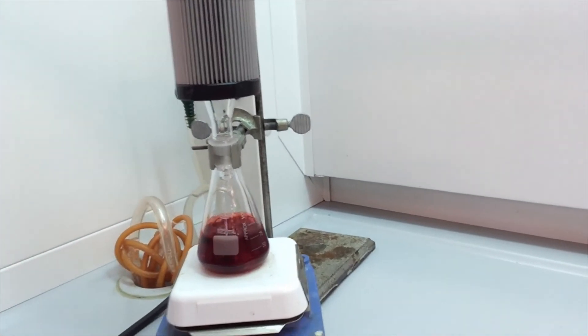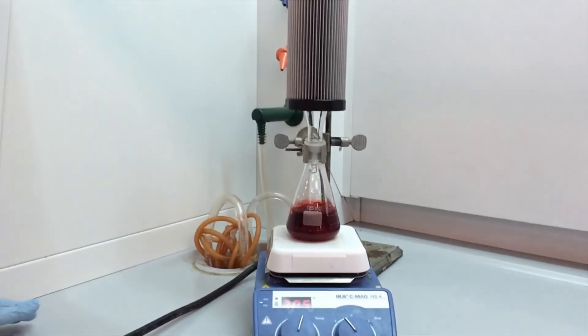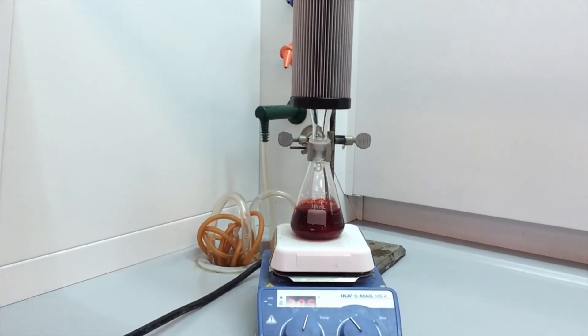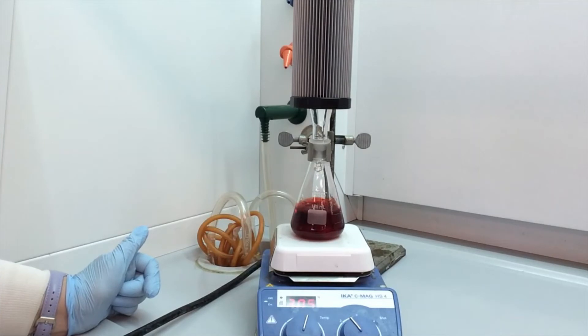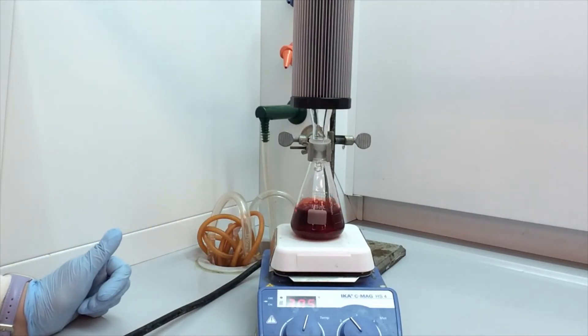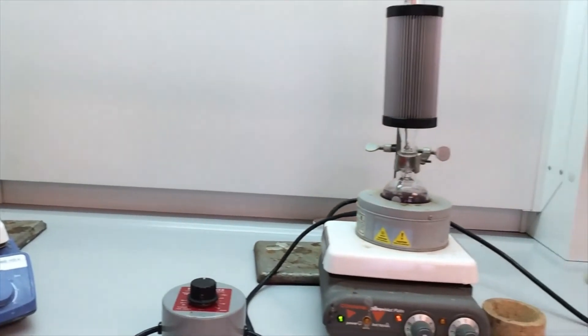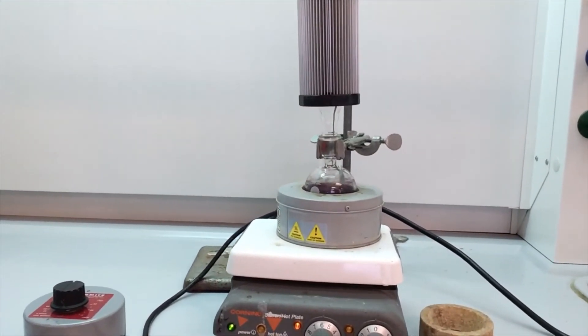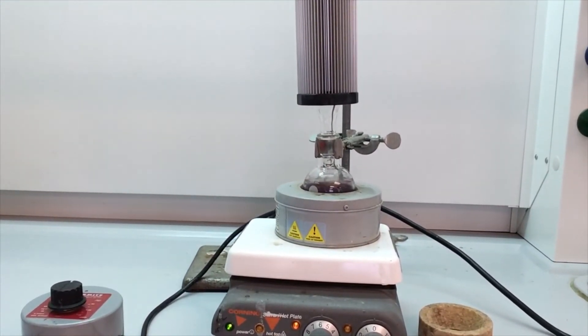So this type of flask takes a little bit longer to start heating up, because you're only heating the bottom of the flask, unlike the heating mantle with the round bottom flask. So over here, the entire bottom half of the flask is heating.